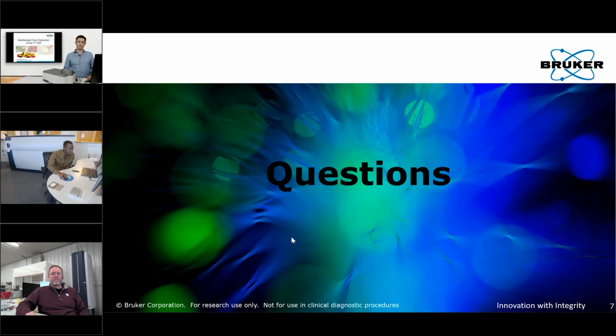So looks like we still have time for a few more questions. For Dr. Krueger, can the method be used for unknown compounds in herbal extracts?